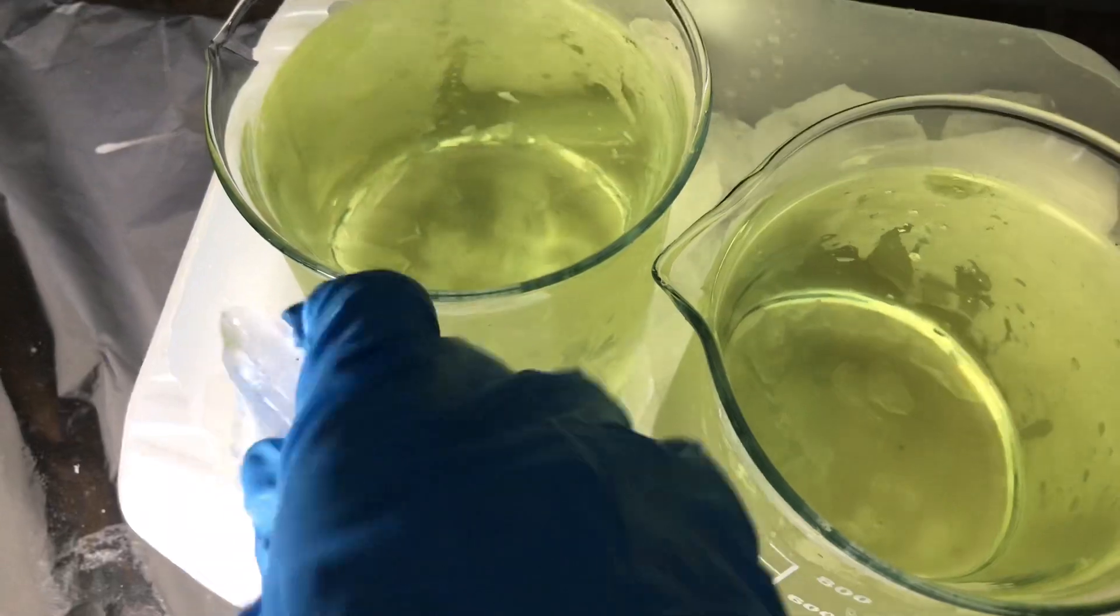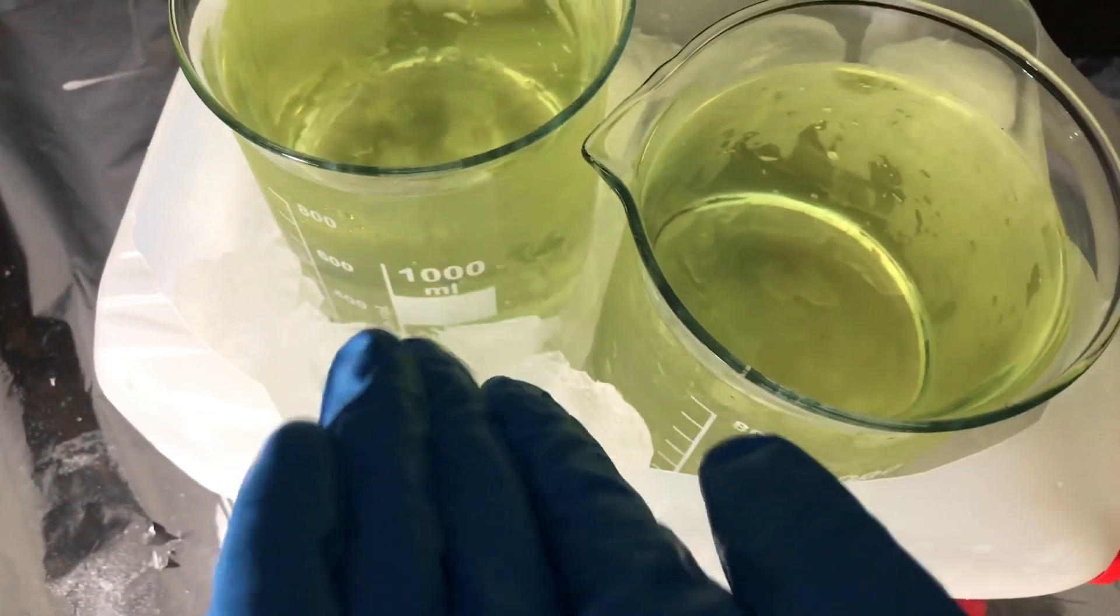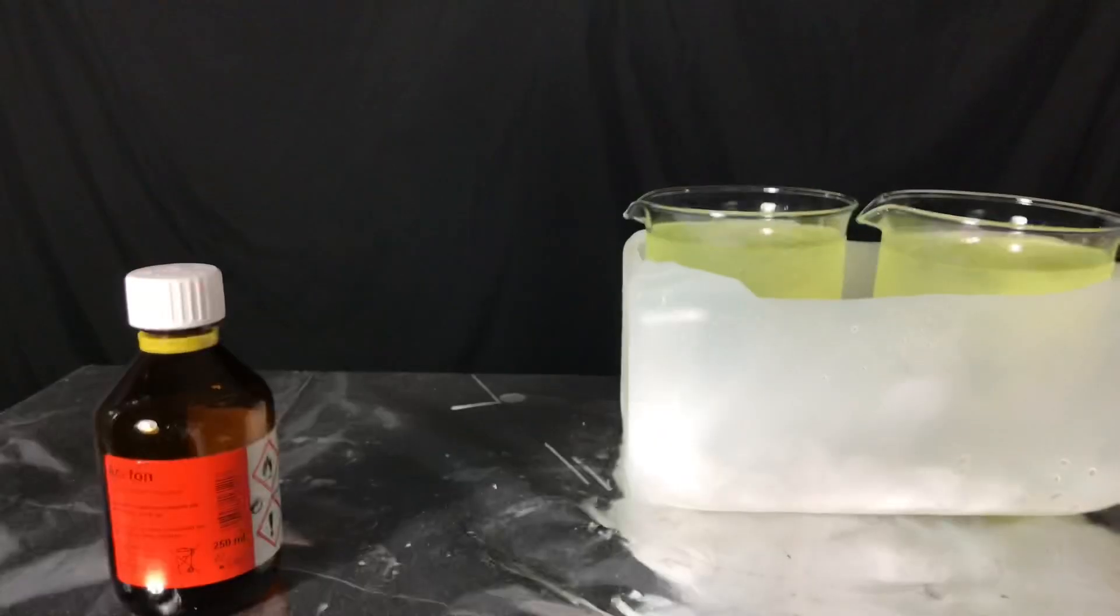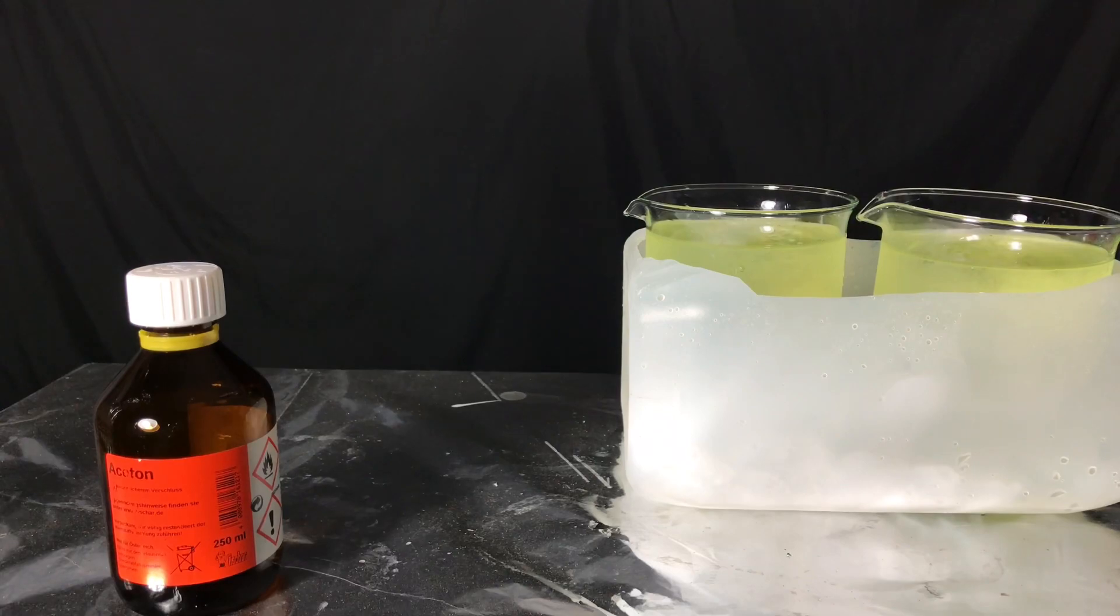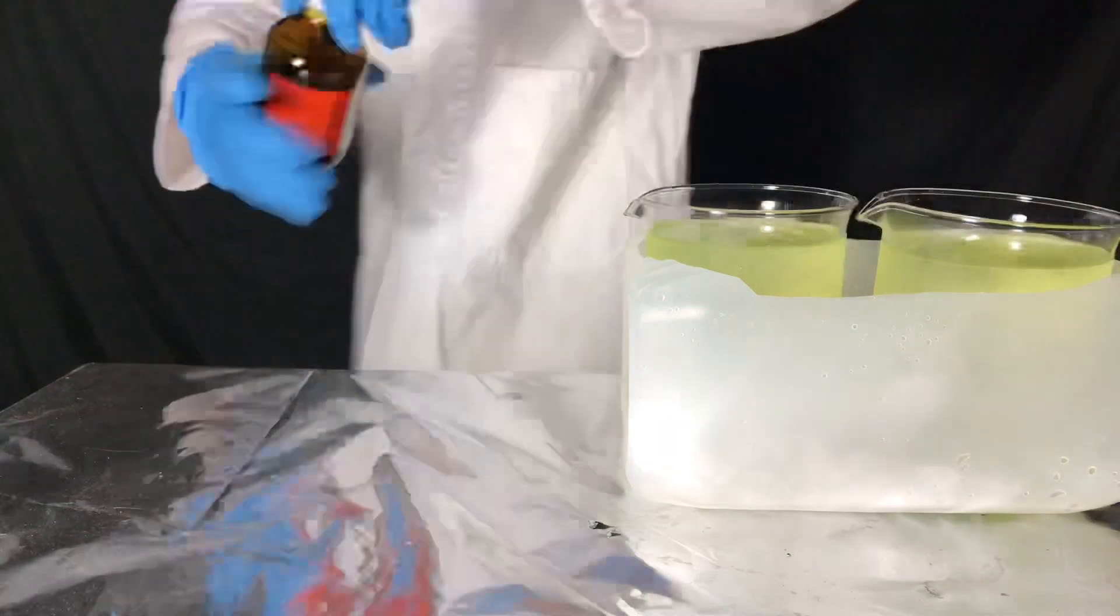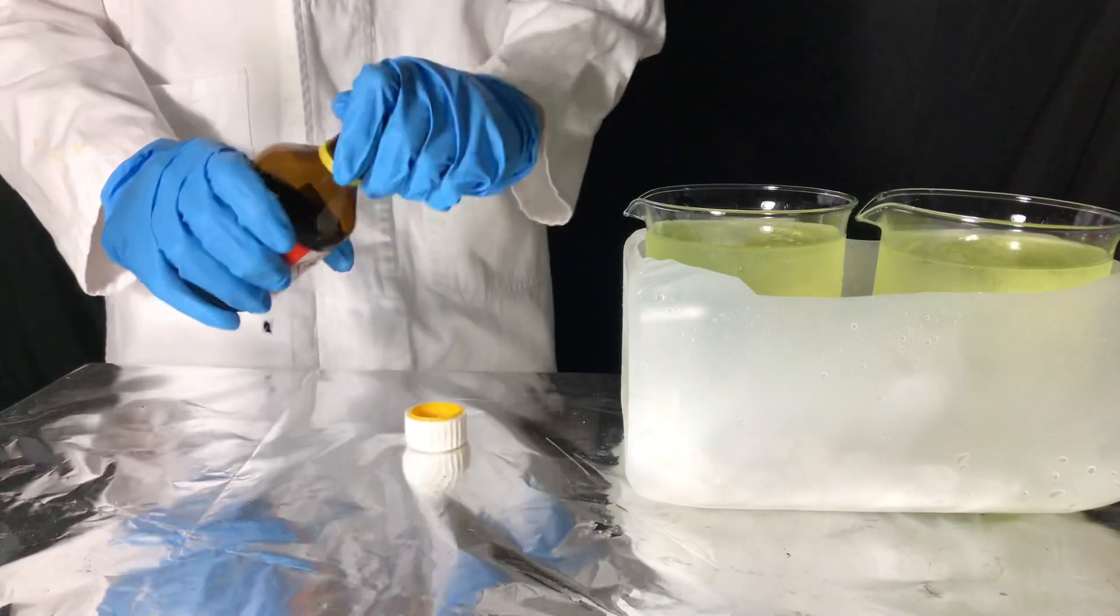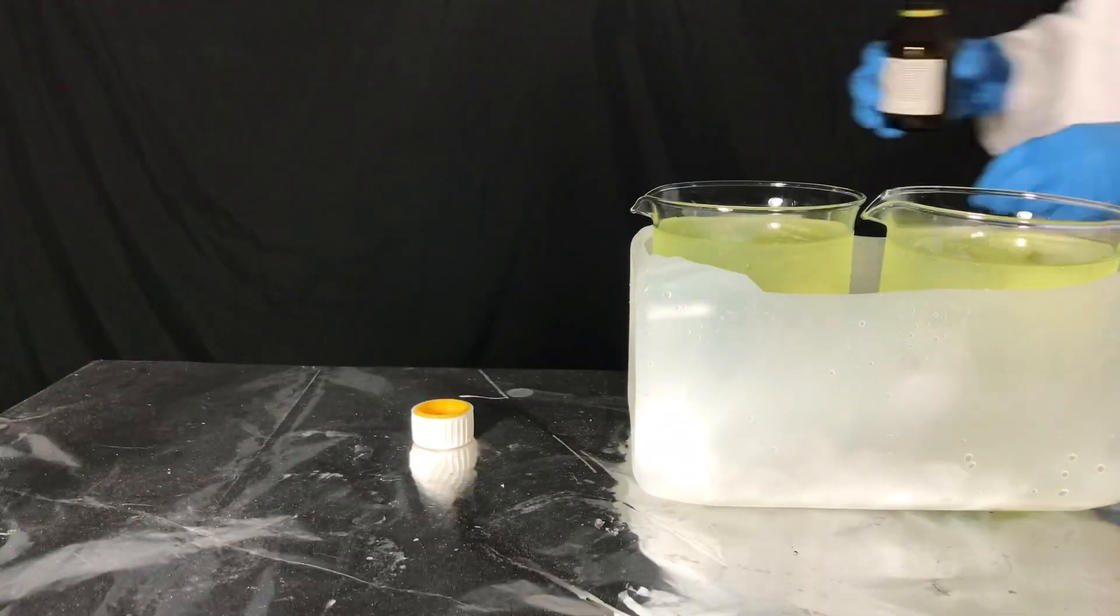The beakers were put into an ice bath because this reaction tends to get hot, and the hotter it gets, the lower our yield will be. We then continued by adding 26.5 milliliters of acetone to each one of the beakers.